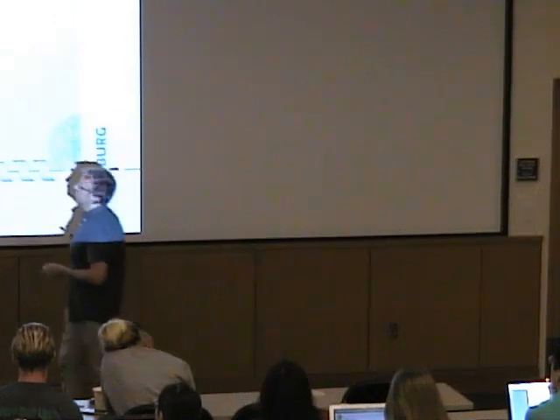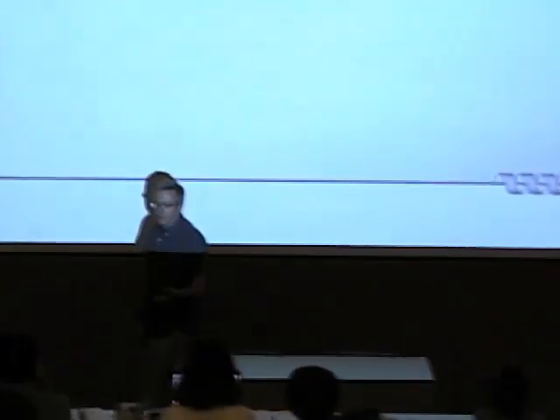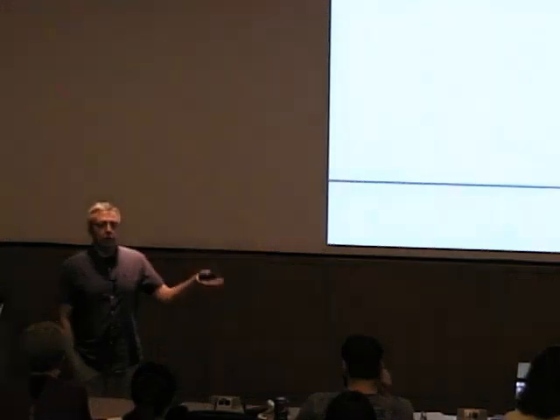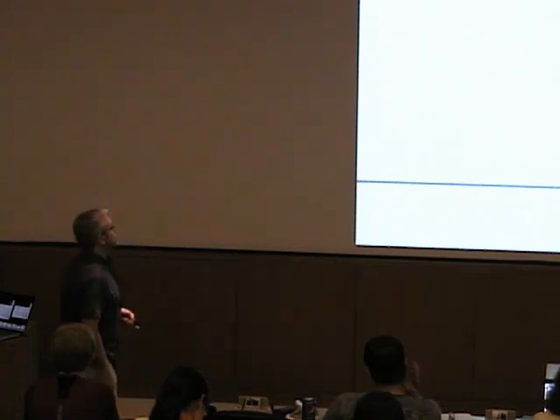Okay? That works. It's called molecular replacement. I'll say a few words about it in a moment. Problem is obvious. The bulk of the structural information is in the phases. So if you take your phases from another molecule, you have to be very careful that your structure doesn't just look like the other molecule. That's not what you want.